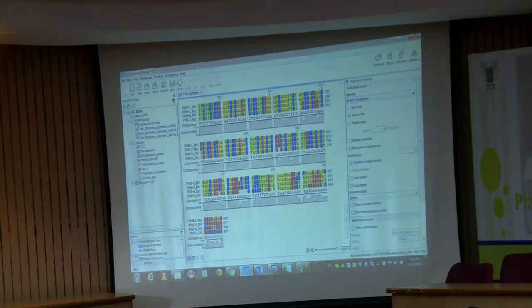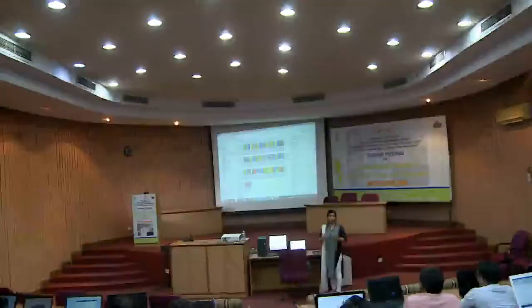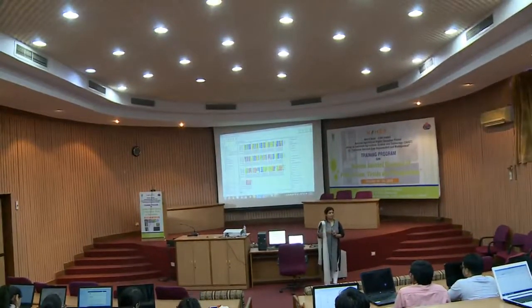If something is there after that, then I have to consider both forward and reverse data, and then only I can replace this deletion with the A, correct. Then this deletion is not actually a deletion, this is bad quality sequencing data which is affecting over here, correct. Am I clear?